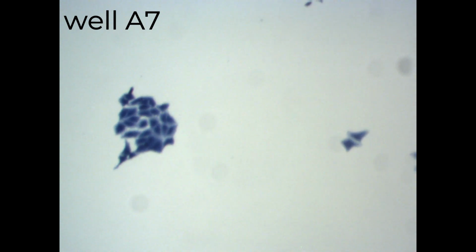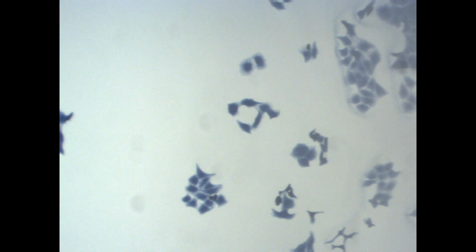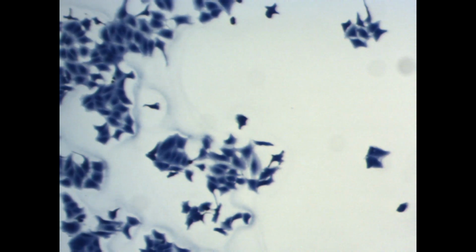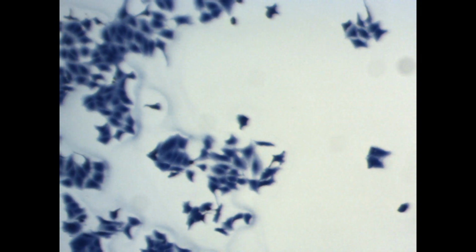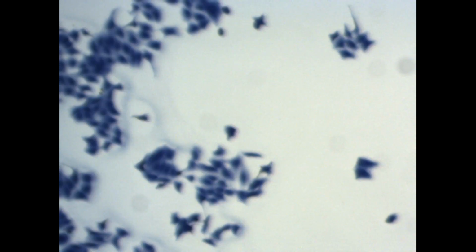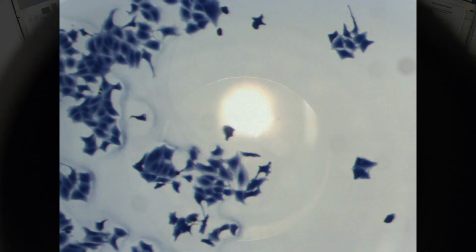And here in A7 you actually see that the cells are slowly getting closer together, but there are definitely different regions. Some colonies are very compact, others are still very scattered. So you have to start getting an impression of what's happening. Clearly still scattered.